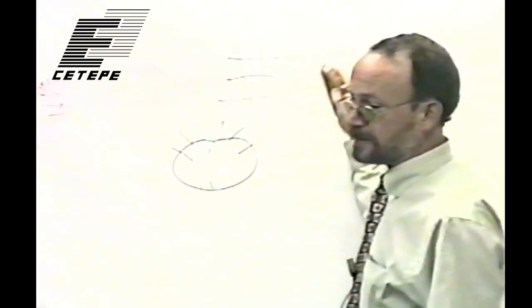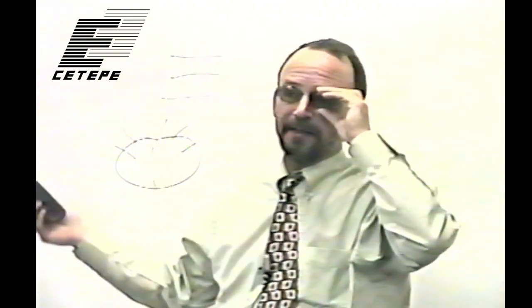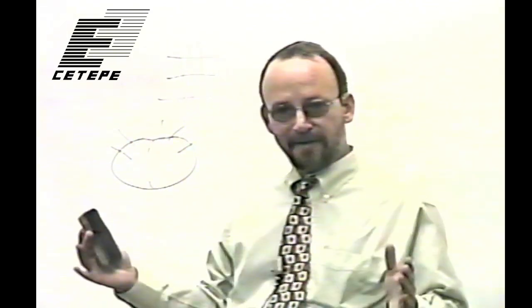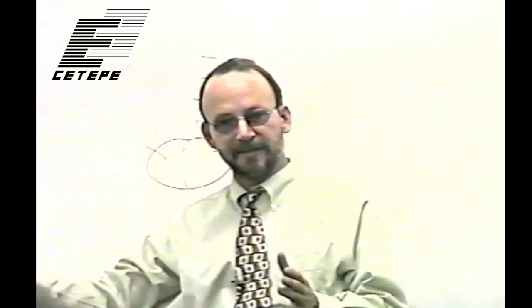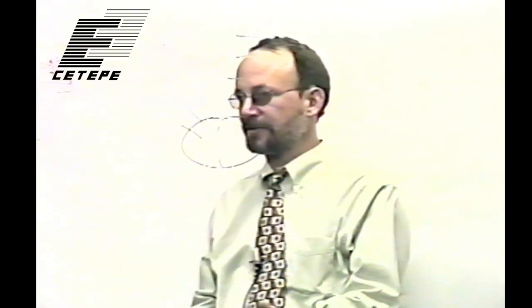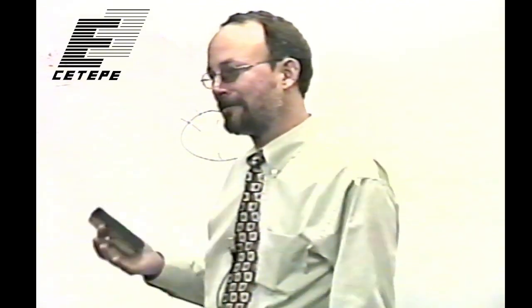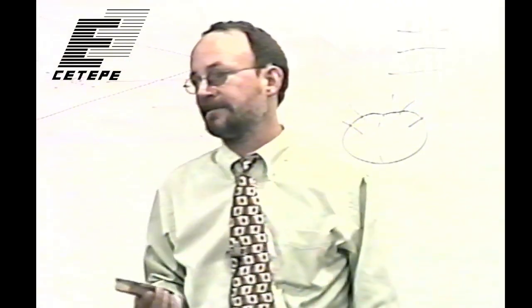And the other disadvantage besides spatial distortion is noise. Image intensifiers tend to be quite noisy, which limits their dynamic range, or the range between the dimmest signal you can measure and the brightest signal you can measure, for a very similar reason as I mentioned for film, because you have this low noise that never goes away. So the dynamic range of it, actually I wish I knew, I cannot find any reference to what the dynamic range of an image intensifier is.